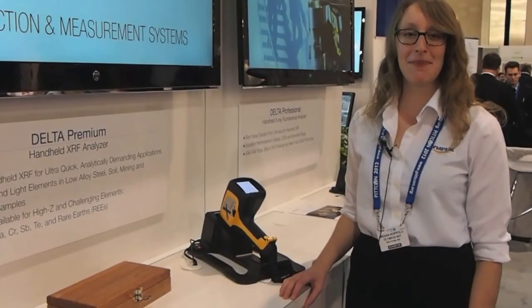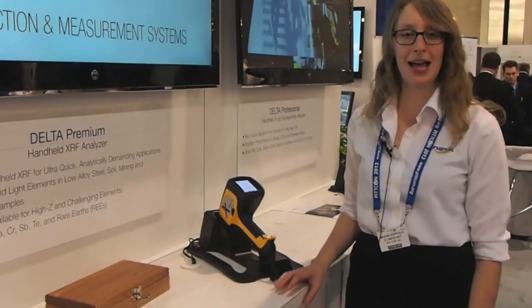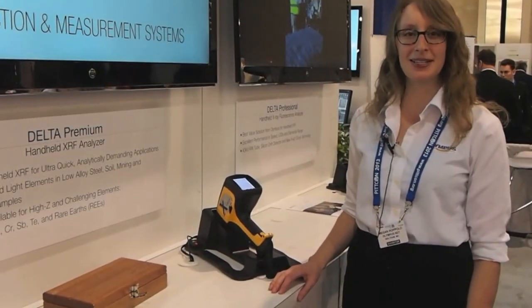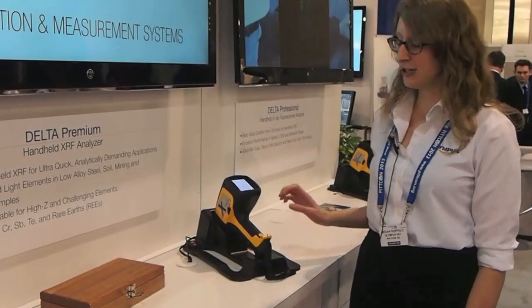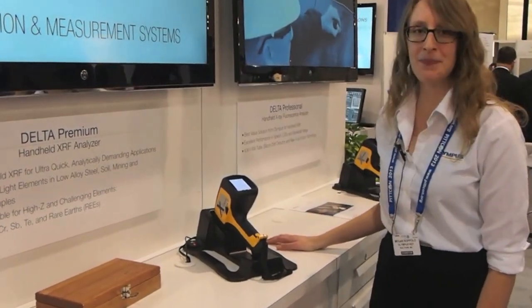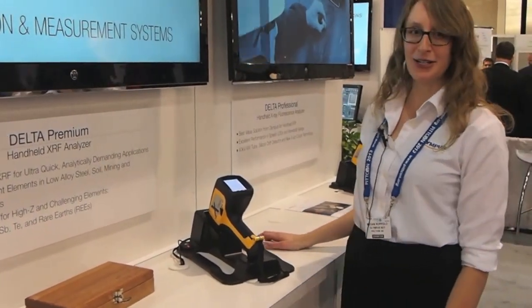Hi, I'm Megan Rapolo. I'm an application scientist with Olympus and I'm here to talk about the Delta Premium, our handheld instrument.